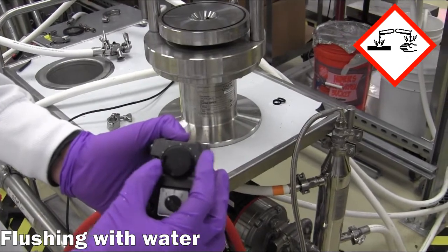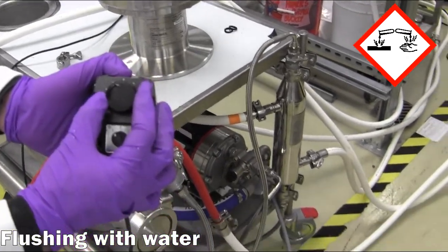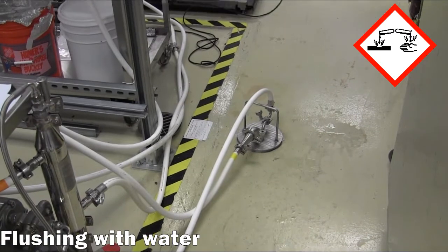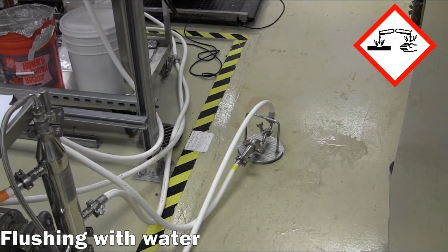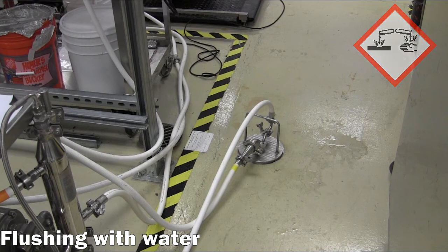Now, the permeate and retentate lines are routed to the floor drain manifold and fresh water is introduced to the feed bucket. The system will continue flushing with fresh water until a neutral pH is reached on the permeate outlet stream.